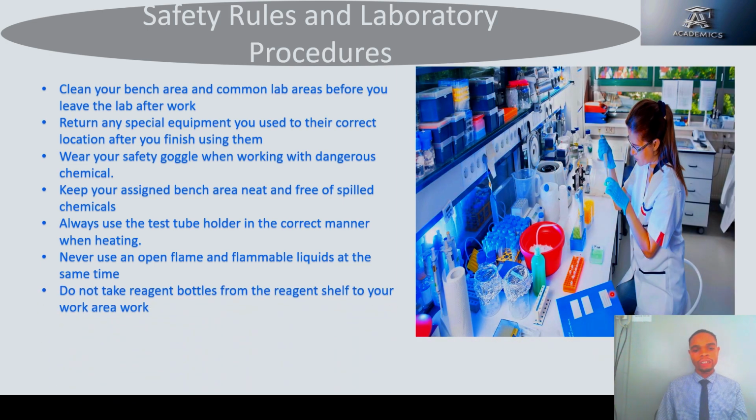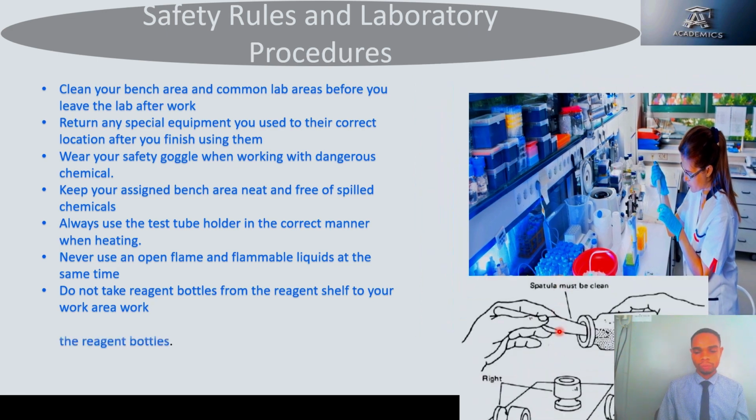And the chemical you want to use, do not bring it to your work area. Take your container to a dispenser, collect the amount you need. The amount you want to use for work, that's the amount you should collect. Don't bring the whole chemical to your work area. You might mistakenly contaminate it, or mistakenly spill it if you are not careful. So make sure only the amount you need is with you in your work area.